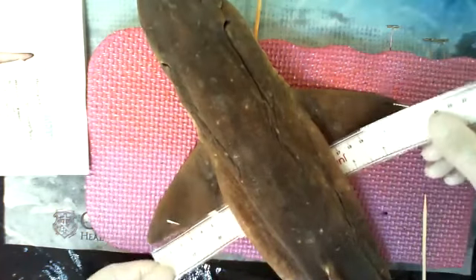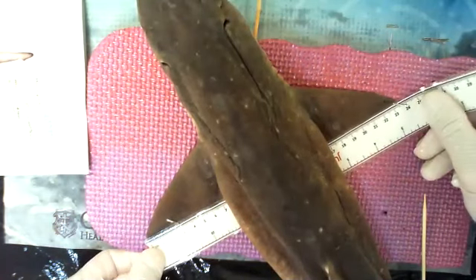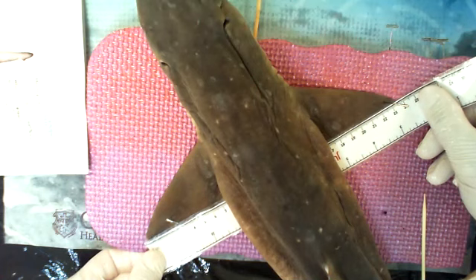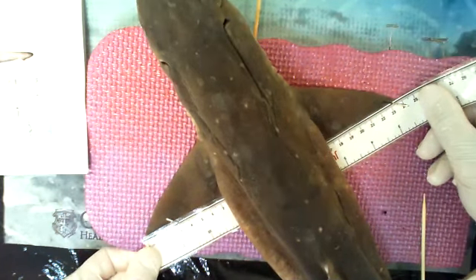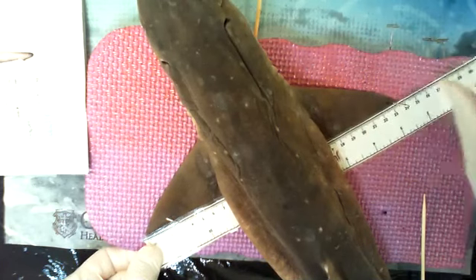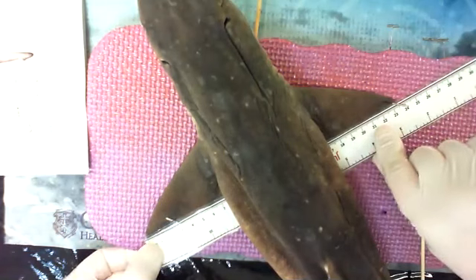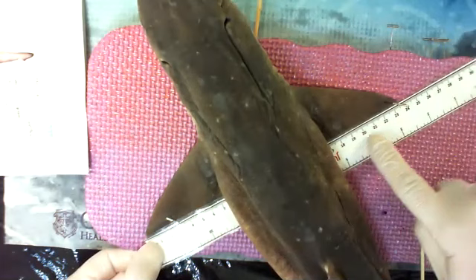If you haven't heard, inches is the British system, and the United States is one of the few places in the entire world that still uses it. Miles and inches and feet. In fact, Britain doesn't use the British system. They use metric, centimeters. All right, so that's right about 0 over here. Went straight through. You saw I slid the ruler underneath the shark.